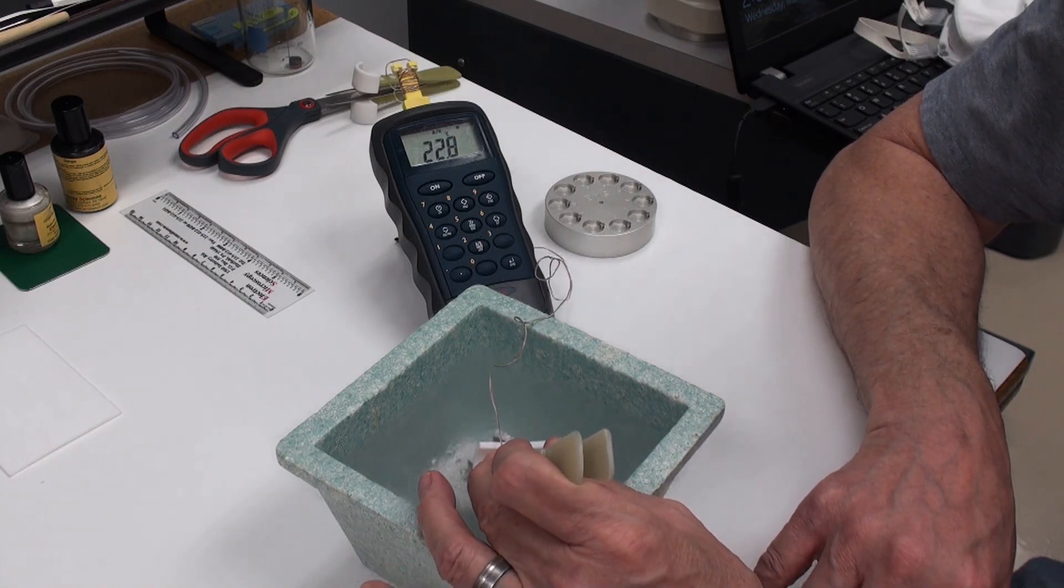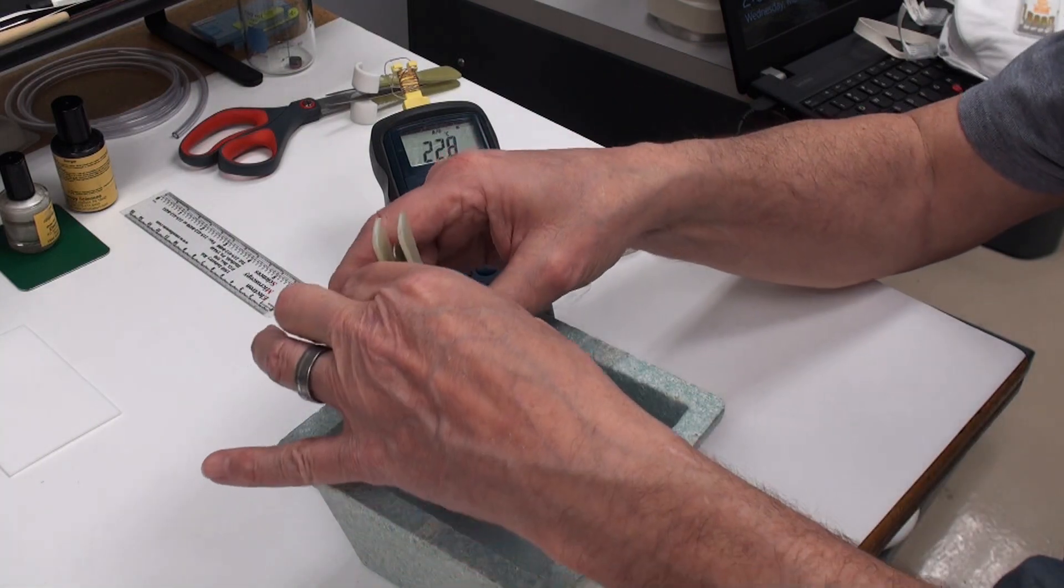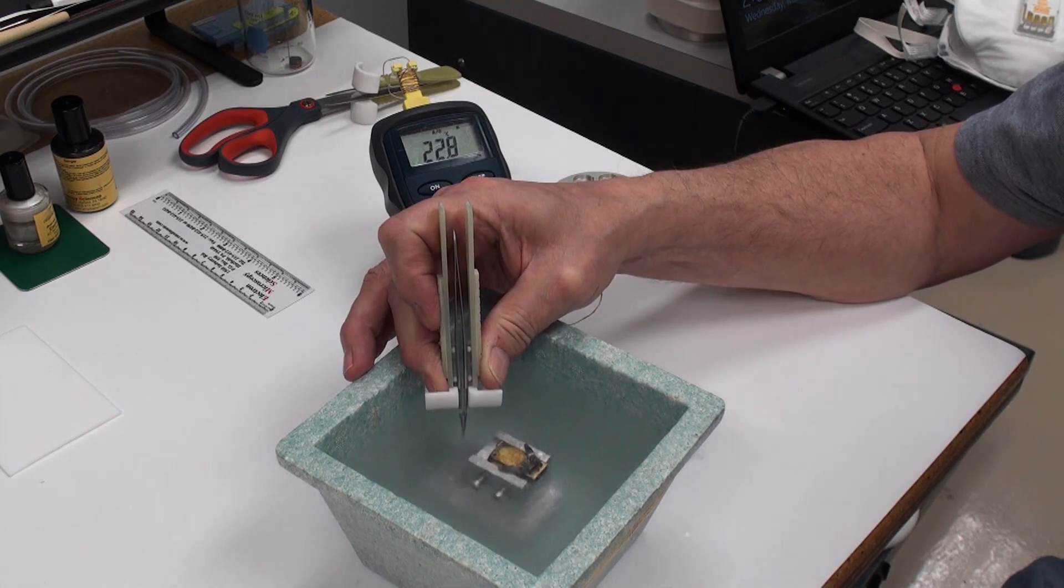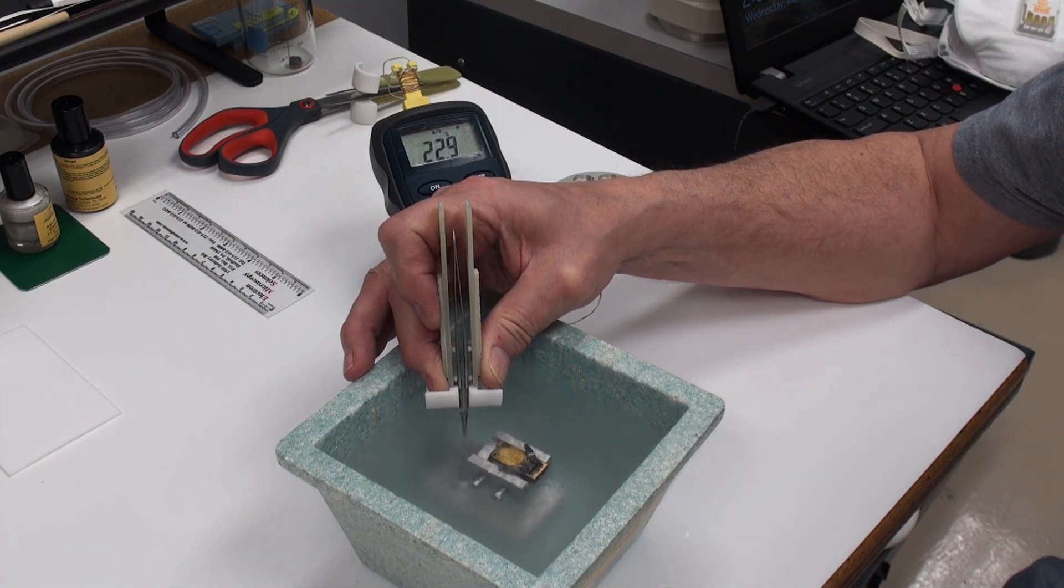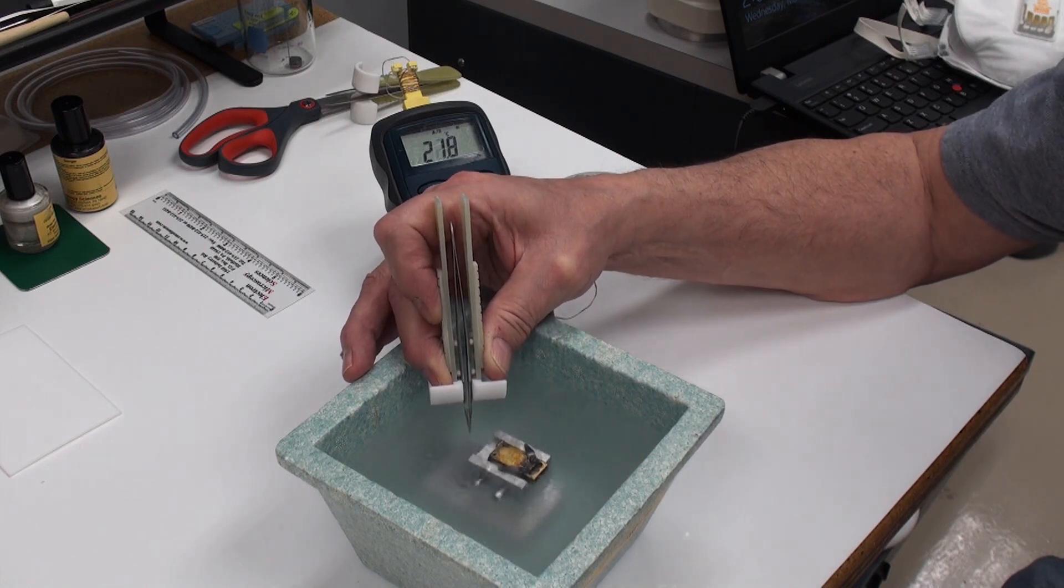As you can see, the tips are well immersed in the nitrogen and the heat from my fingertips, anti-insulation, the temperature is actually going up rather than down.